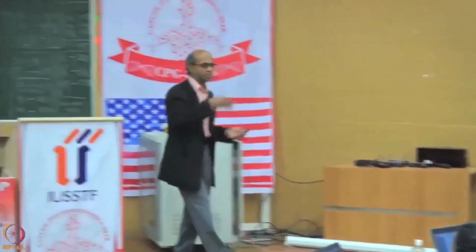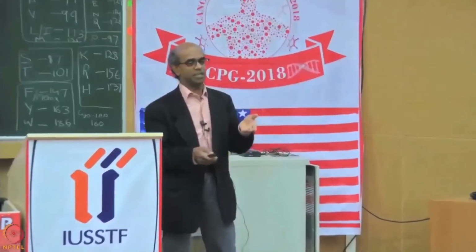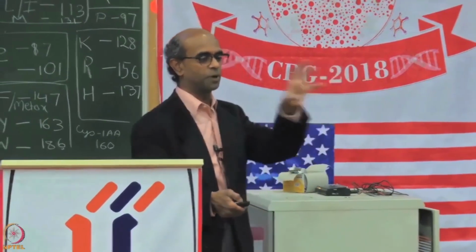That's what we are doing here. We are calling that the reference because we are using it to take relative ratios. In the breast cancer project that you're going to hear about today, the CPTAC prospective, retrospective breast cancer project, the reference was basically a collection of tumors. We had about 100 tumors there, I think 40 of those went into the reference. But we made sure that the proportion of the different types was the same.